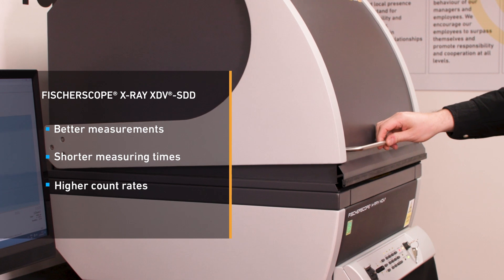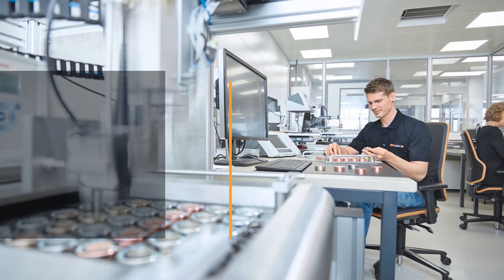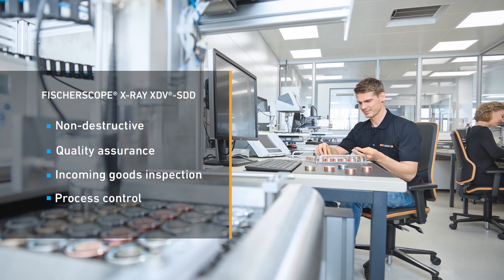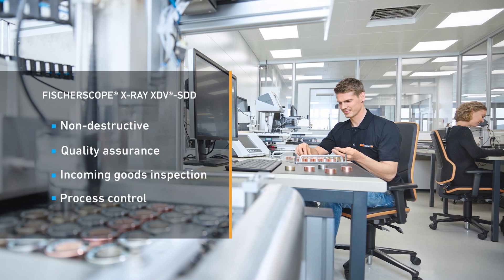Its new DPP Plus processor provides high count rates, shorter measuring times, and improved precision. Its fast, programmable XY stage is the best solution for automated measurements of multiple measuring points in quality assurance and production monitoring.